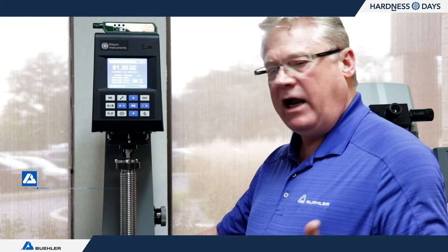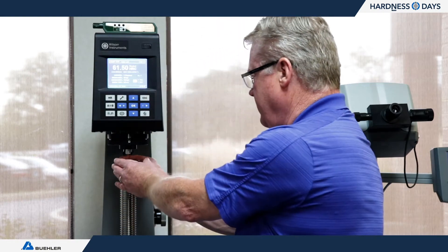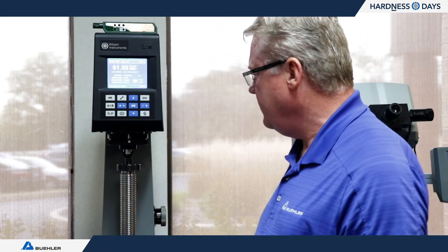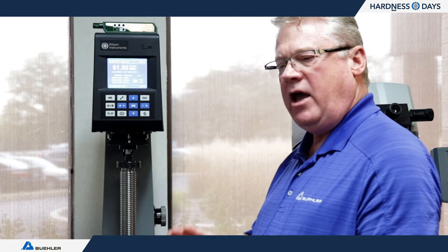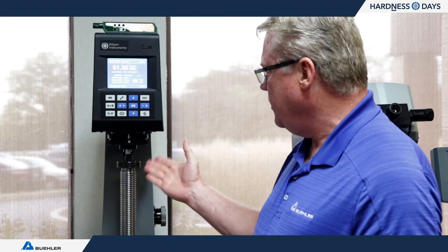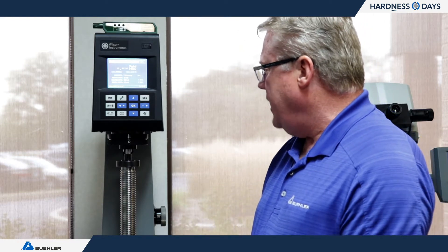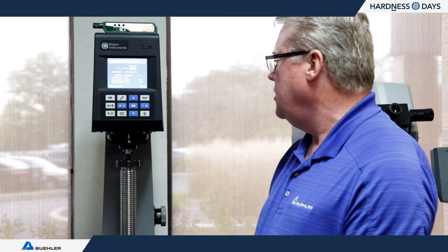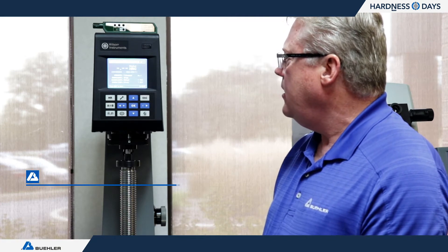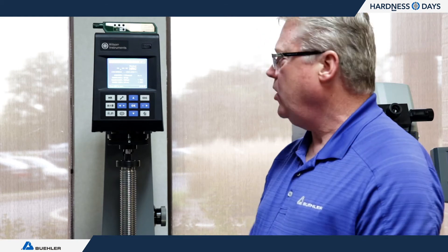The first portion of the direct verification is the hysteresis test. You can do this on your machine without any help from Buehler, but here's how I normally set it up: I put the anvil upside down so the post is sticking up. The Rockwell scale for HRC goes from 0 to 100, with the usable scale between 20 and 70. With this test we're making a non-indent, so I'd expect these numbers to be close to 100. The first result is 98.9. This is done ten consecutive times, and you average the last three — that number should be 99 or better to comply with the standard.